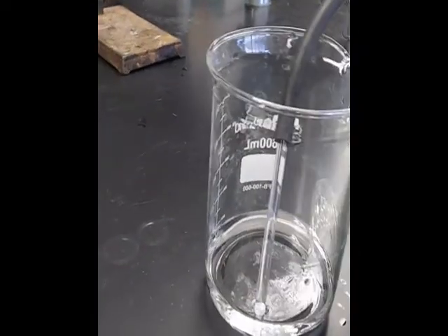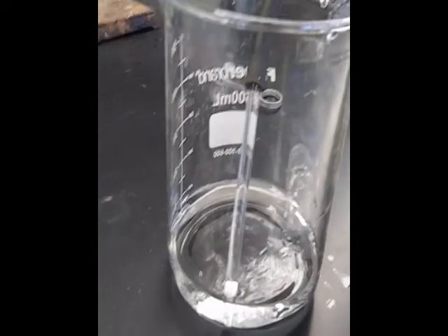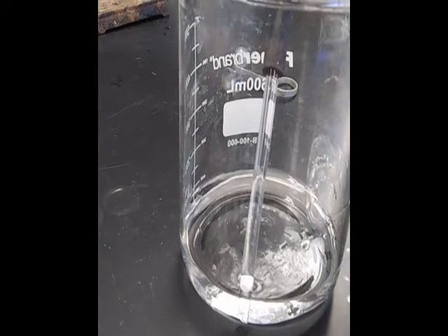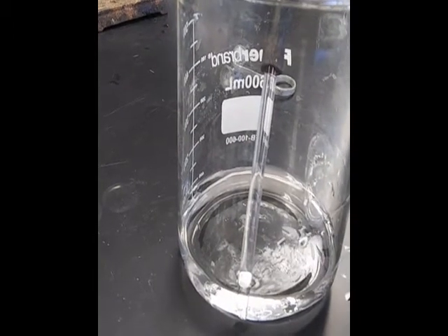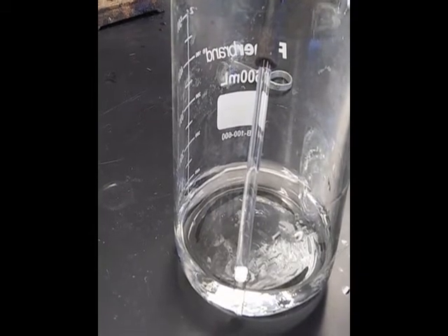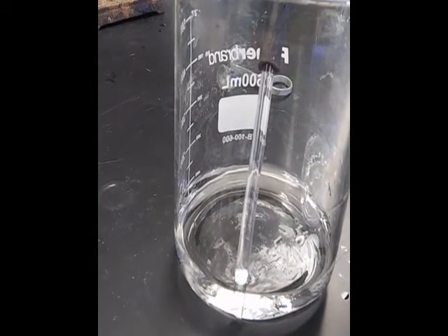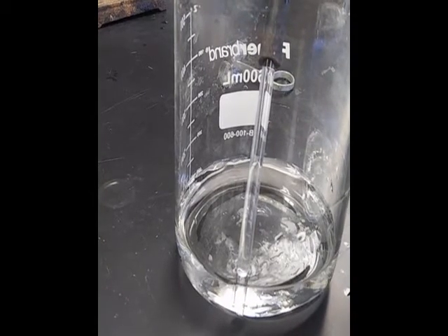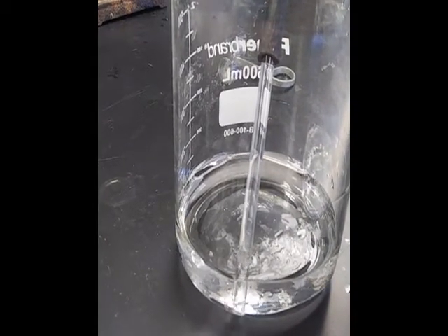Okay, so now I'm just going to kind of go over here and record the water coming as I continue to heat it somewhat gently. So you can see it's starting to fill up with water. So I'm just going to go until I collect about, what did it say, 300 milliliters or something like that. That's working pretty well.